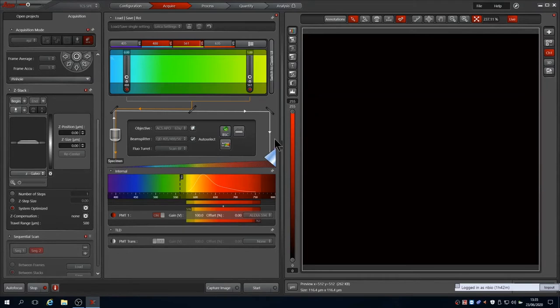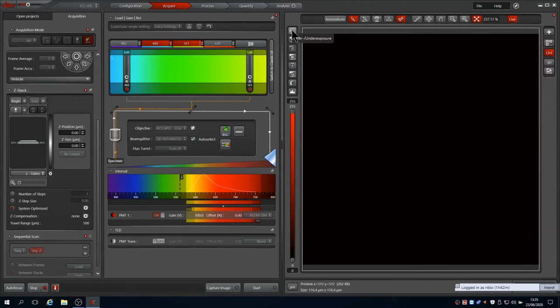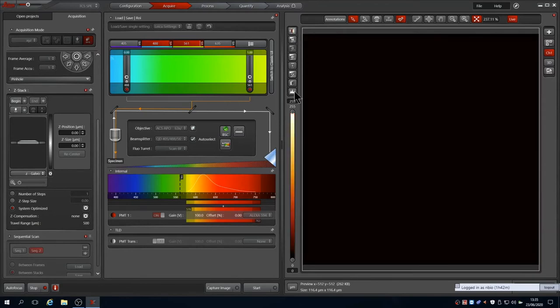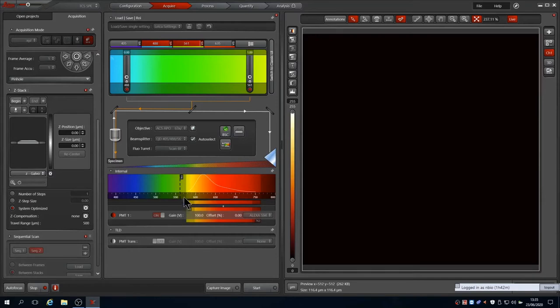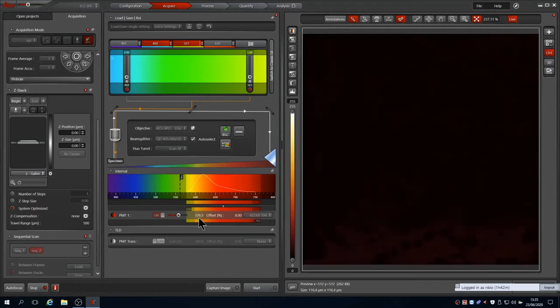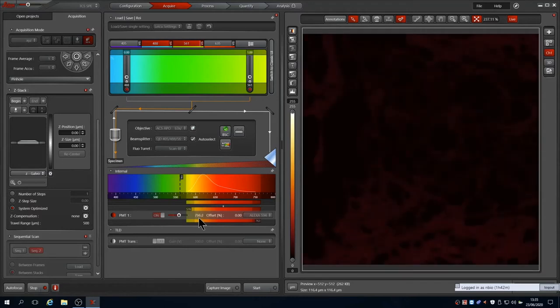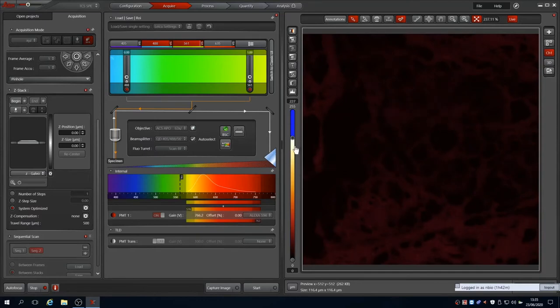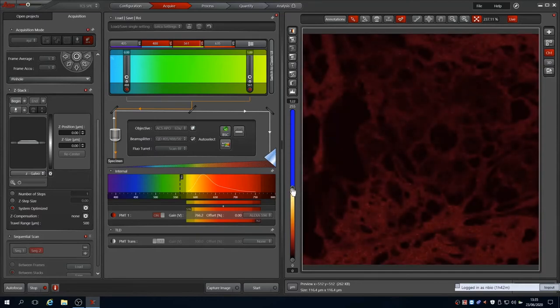We can see that we are still on sequence 2, so the image being captured is of the Alexa 594 channel. The image looks black using the red lookup table that we have. Clicking the LUT icon swaps to a range indicator icon. This lookup table shows a glow scale, making dimmer signal easier to view. The image still looks black, so we'll increase the PMT voltage. Around 700 to 750 volts is a good level for signal with little noise. Now some signal is visible, we can enhance the visualisation of it by pulling the range indicator down.